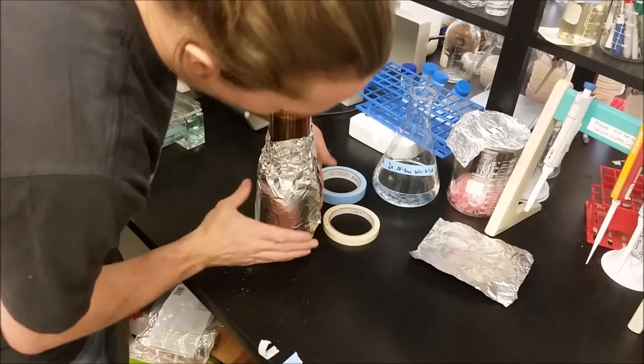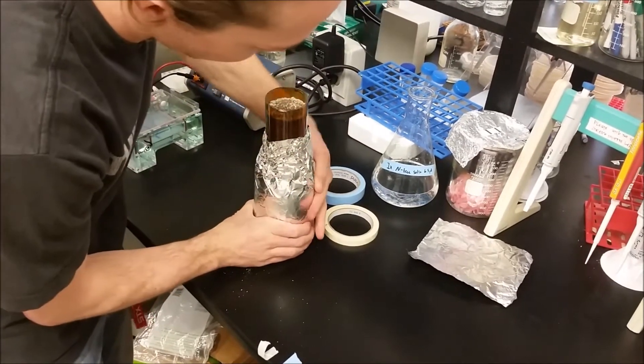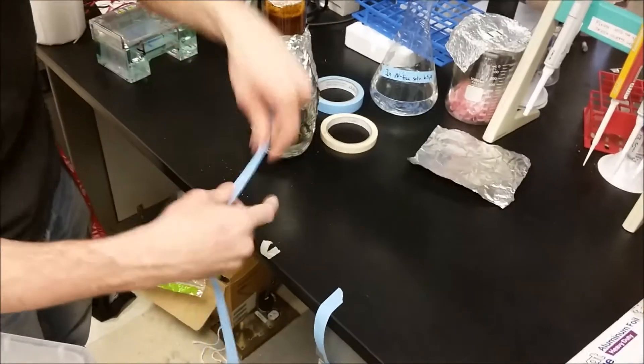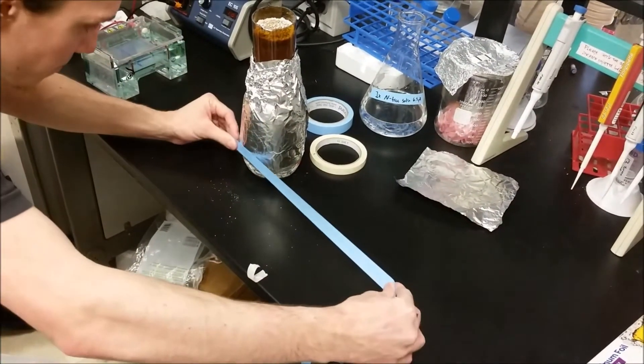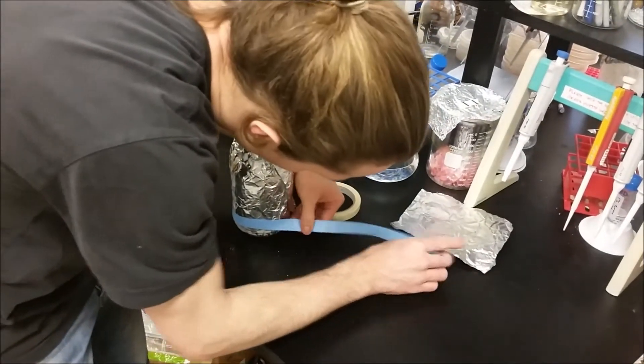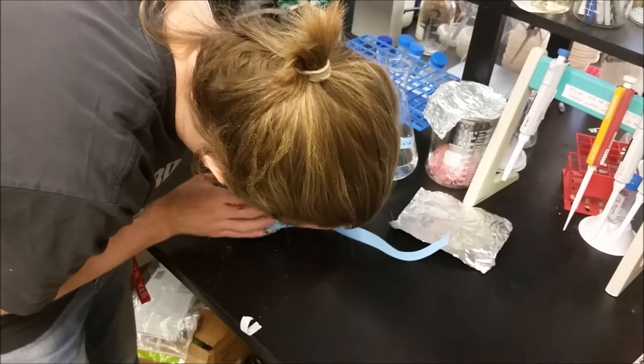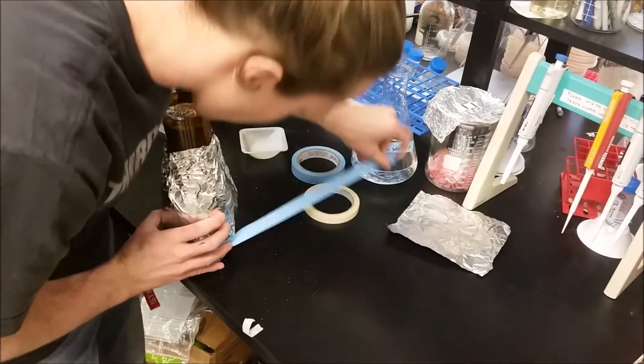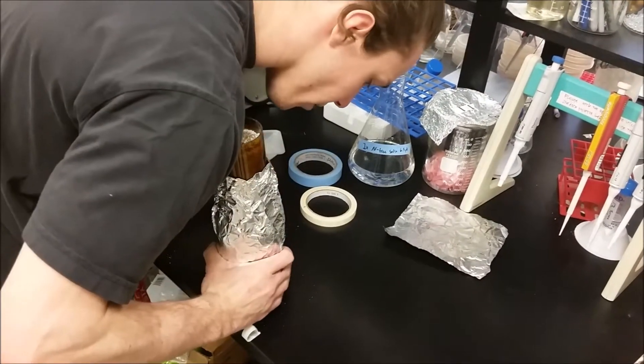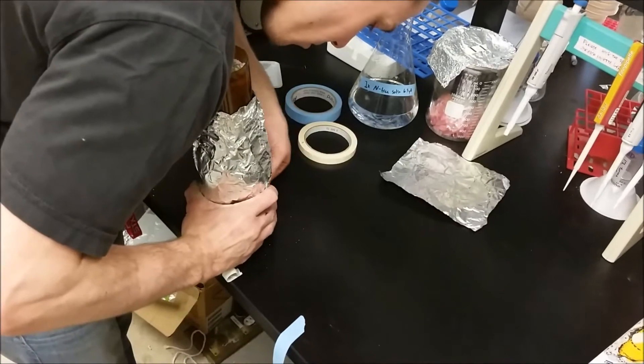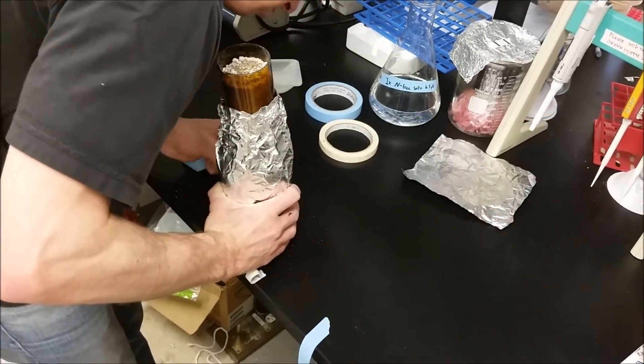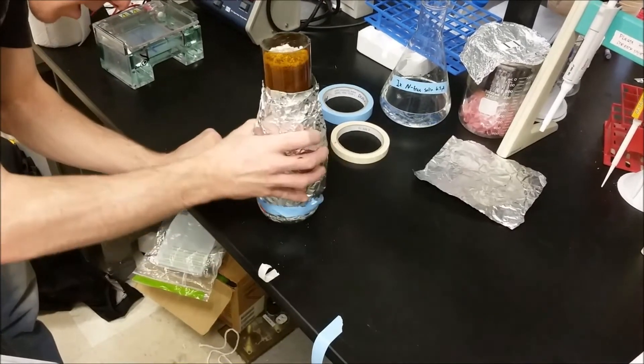Now the next step is we're going to add some tape to keep this foil down. I'm going to take a long piece of tape here and wrap it around the bottom to keep our foil connected to the jar. Just going to get it all the way around, just like that.